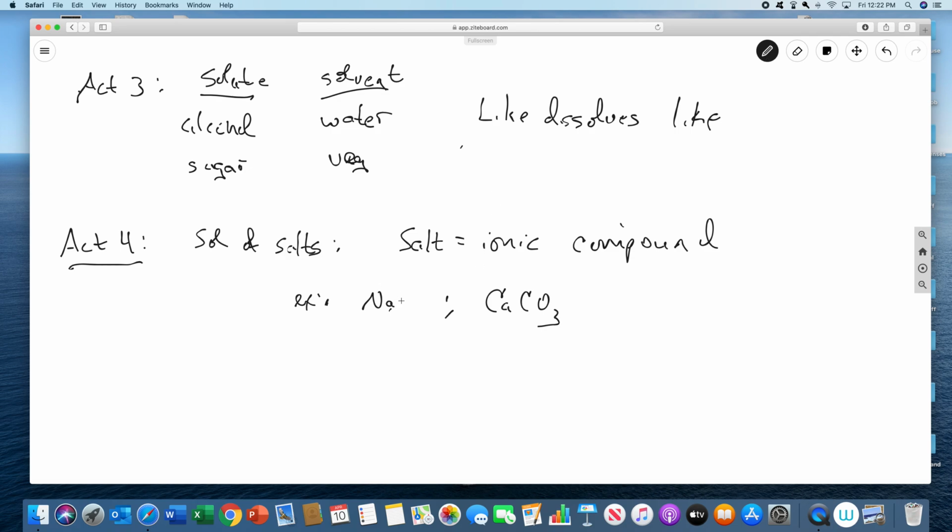But what you'll find is some ionic compounds dissolve in water and some do not, and it's actually based on experiment. And so what we would do in the experiment is add a very small amount, just enough that you could see if it doesn't dissolve, put it in water and see if it dissolves. All right, and so that's what you're going to find. Some things dissolve in water and some don't. All right, and then there's 2 more, 5 and 6.